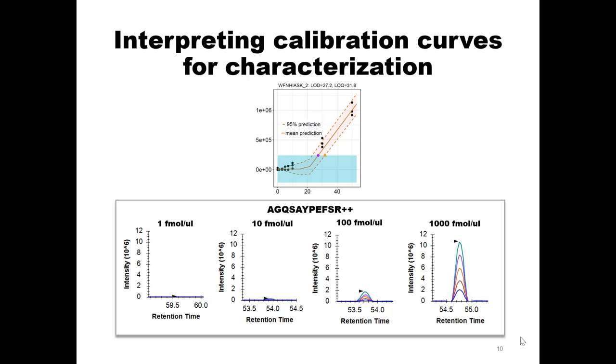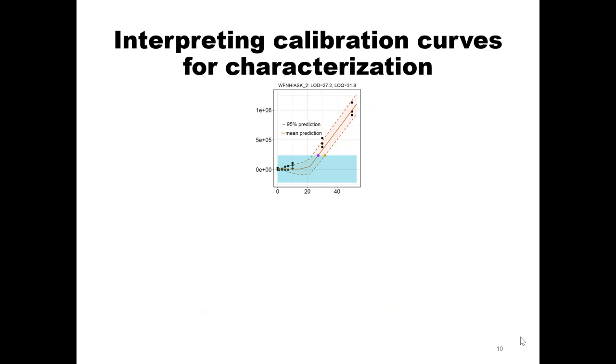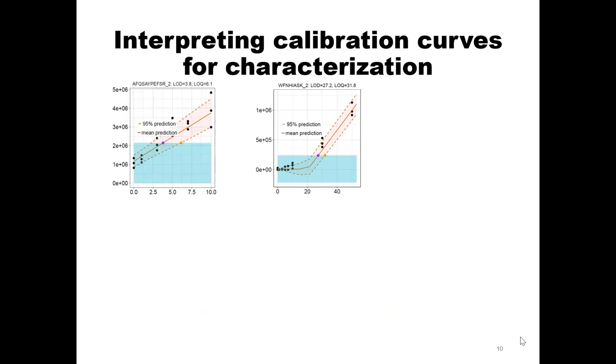I just said that this is the canonical shape, but real life is not always canonical. So some other shapes of curves that you might see are, like Sue was saying, this completely linear curve. This is a symptom of not having enough points at the lower concentration range. So this is in the blank. There's clearly some value of signal, some value of background here, some value of noise. And somewhere between this lowest point and this noise point is actually where the LOD is. You just can't assess it because this is a totally linear set of calibration curve samples.